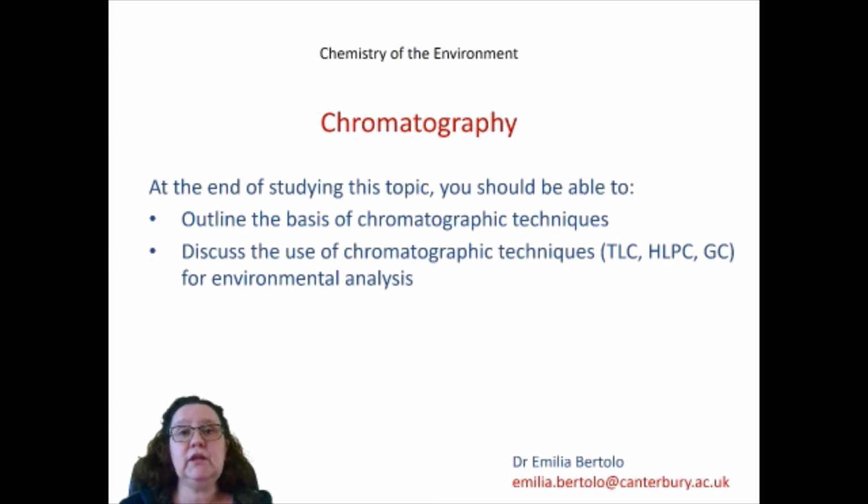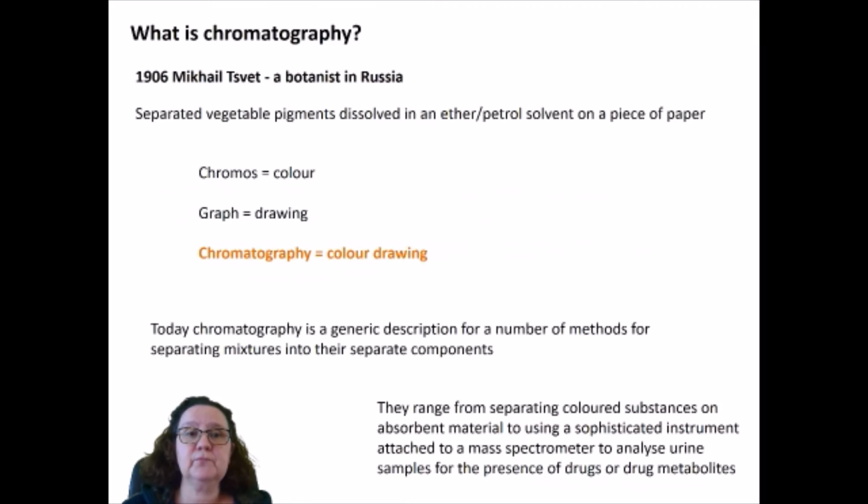This video will be split into several sections just to make it easier to follow. So what is chromatography? Well, chromatography is a generic term that we use to describe a series of methods to separate mixtures into their individual components. And they can range from separating colored substances in a particular absorbent material, to using a piece of equipment to do a separation of a mixture. But in all cases, it is about a mixture which is separated into individual components.